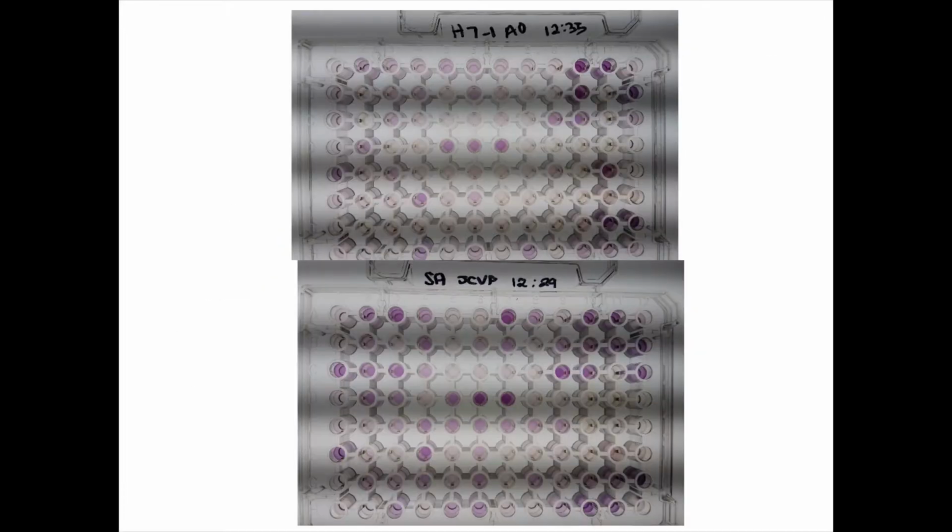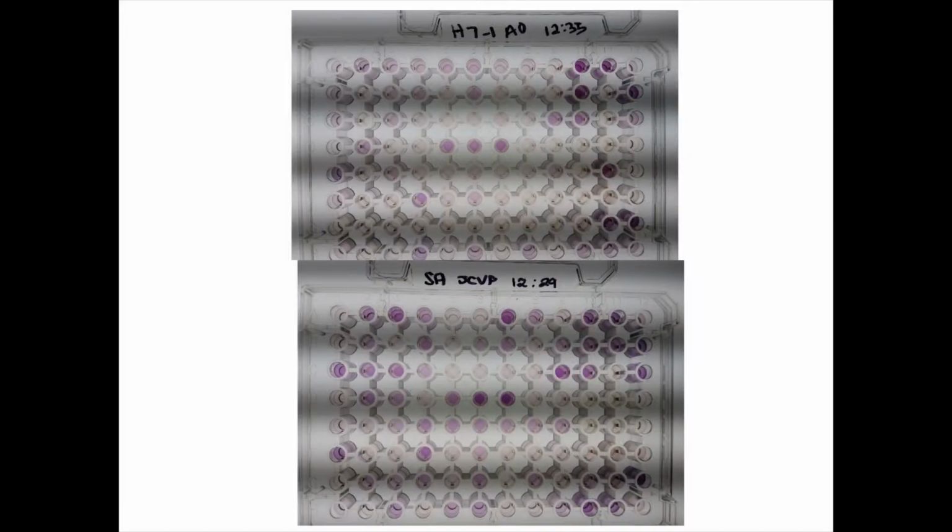So here's a couple of images. Experimental results rarely look as clear-cut as what the manufacturer shows you, but these are a couple of plates from some bacteria from my research students. And so this right here, this is Janelle's plate, and she was looking at Staphylococcus aureus. That's what this means right here. And so this is from a different bacterium. This is from an unknown bacterium, and that's why it's called H7-1.